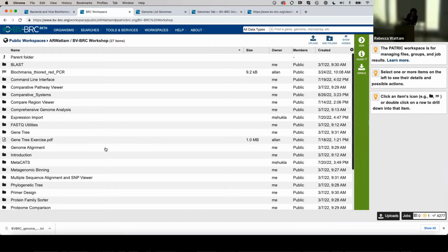Another thing you should consider too, I never really used to do this. I just always used to blow past this, assemble my reads, annotate them, do the analysis. And it was at the time when I was doing the comparative genomic analysis that I would realize, oh my, those reads were bad. This is a terrible genome. And that generally can take you days to maybe a week to figure out. So now it's the first thing I do.